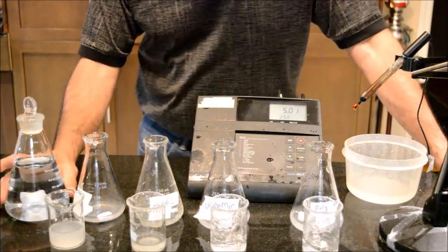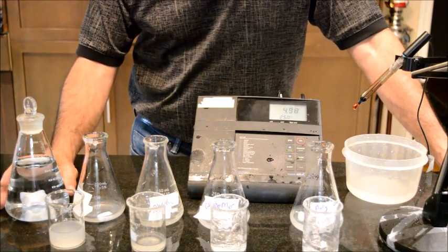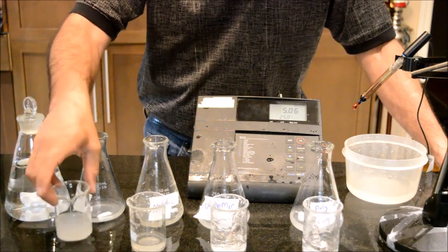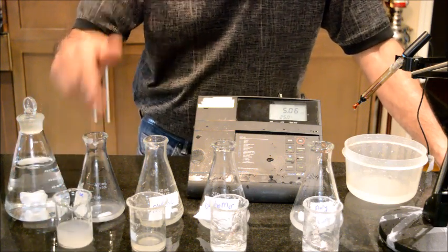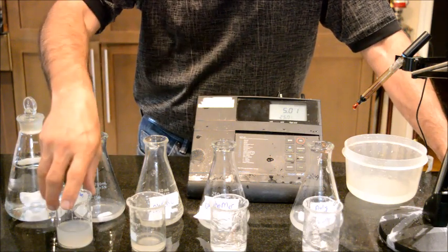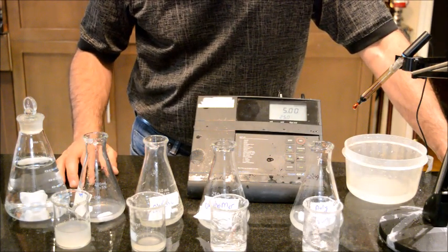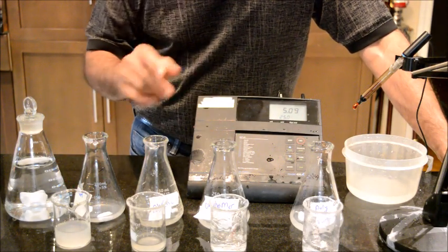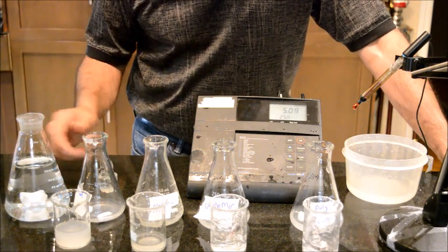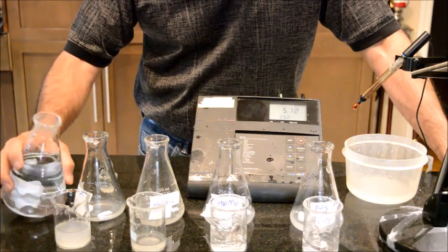Now the vagina will hold somewhere between 3 to 5 ml of liquid. However, the amount that you insert into the vagina probably is in the range of 5 grams. But in the beaker that I have is definitely more than 5 grams. So I'm trying to get a similar ratio, like a half and half maybe, to see how these gelling agents behave in the presence of vaginal fluid.